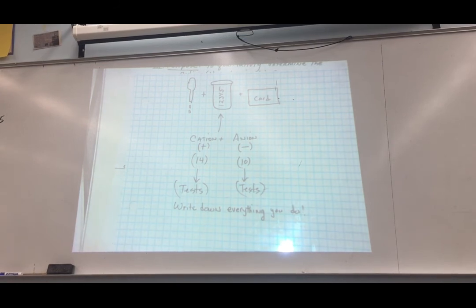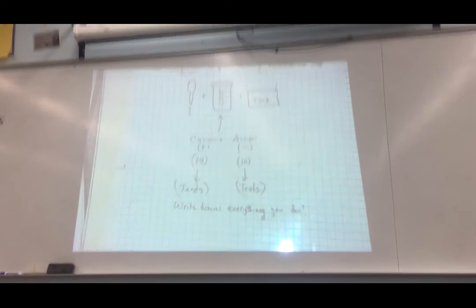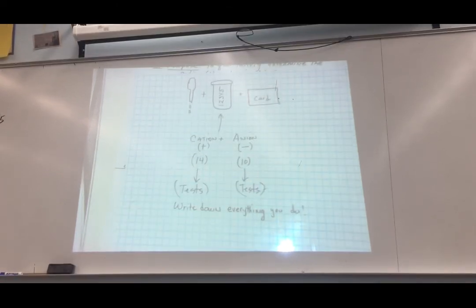There is one test that you're going to do at your table, and that's the precipitation test. And I probably won't get to that until Monday, and that's very important that you get the precipitation test down for that. All right, so let's take a look at our handout for the lab.